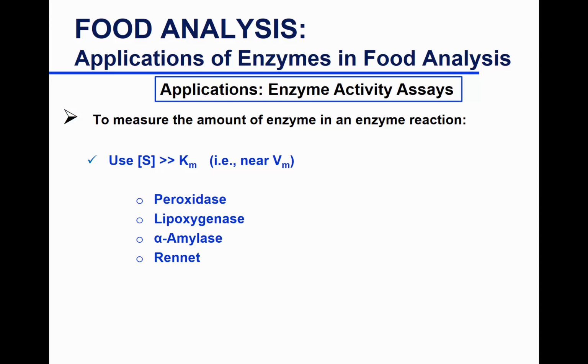So the higher the alpha amylase, the falling number will be lower. The plunger will fall lower in your graduated cylinder. So it's an indirect measure of alpha amylase activity and potential hydrolysis of starch in your flour.